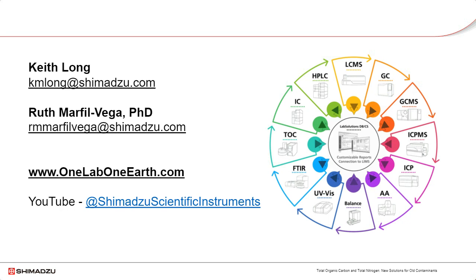Relating to the additional materials, as you've heard, Keith presented about many options that are available for Shimadzu TOC. If you want additional detailed information of the results that you can obtain with the instrument, you can download the handbook that you can access from your console. And there are the results from using the TOC-L for a variety of applications.